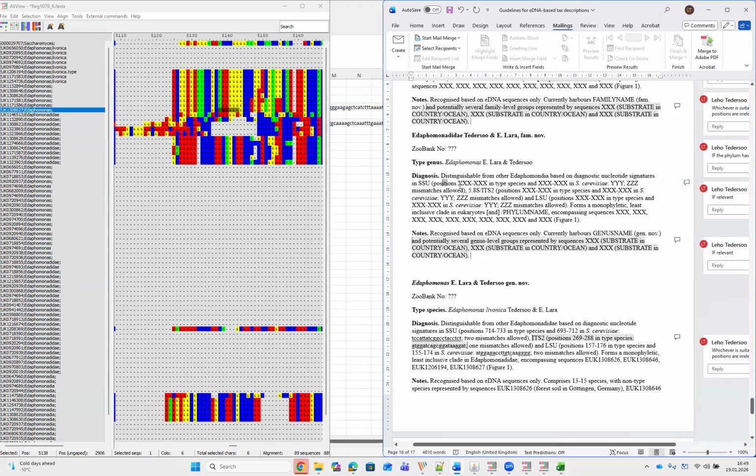Again, we will have to take care of the microbarcodes as we did it for the genus. When we go up, it will be more and more difficult to find those places. But let's exercise together again, defining those species for the phylogenetic species concept.